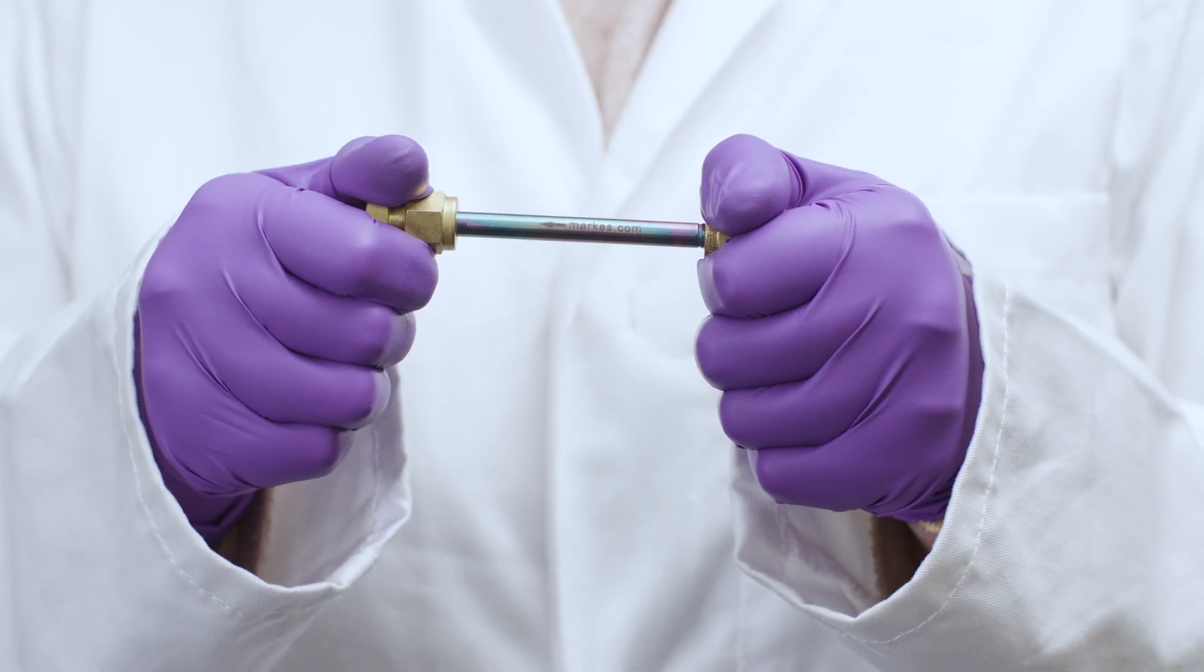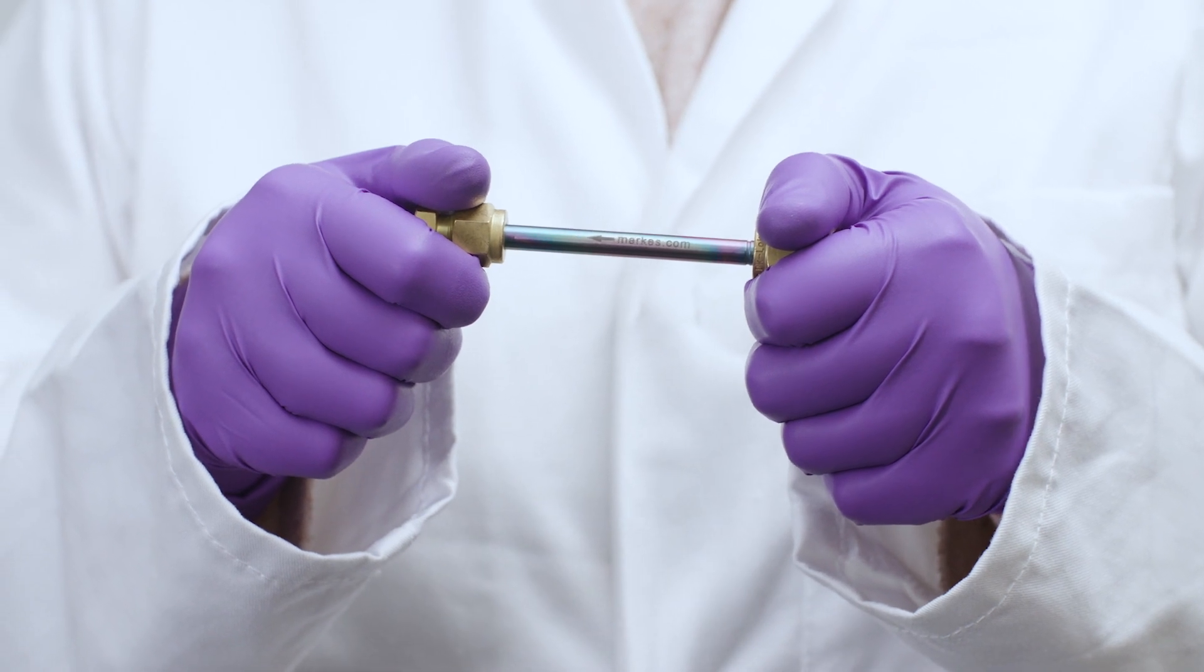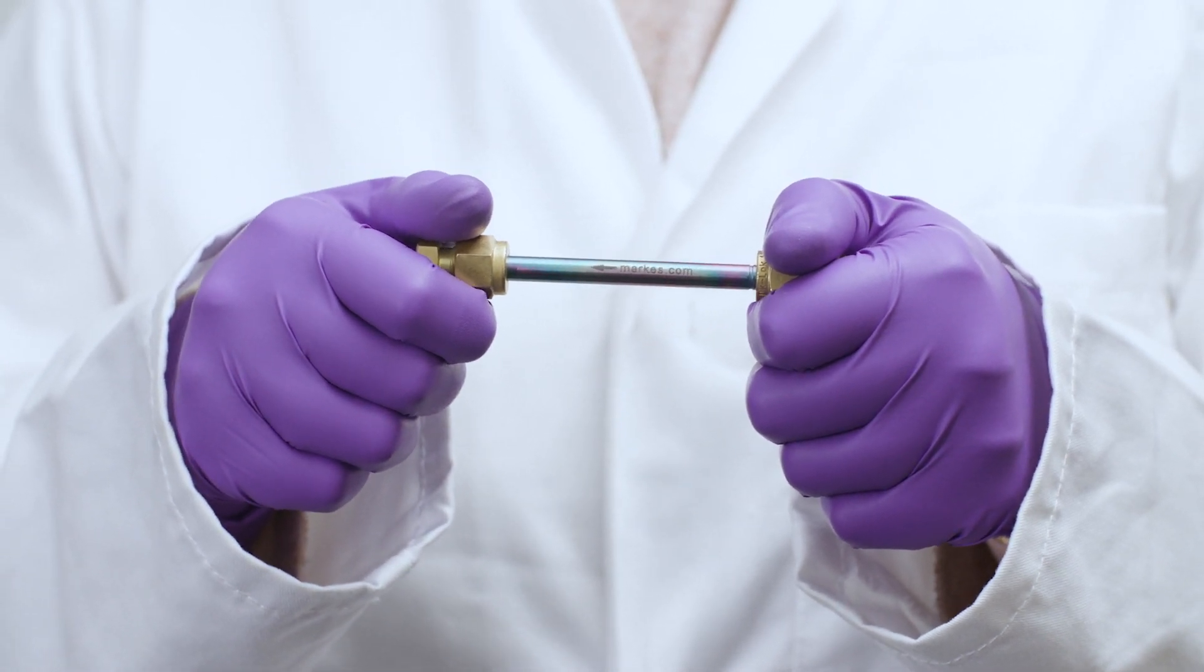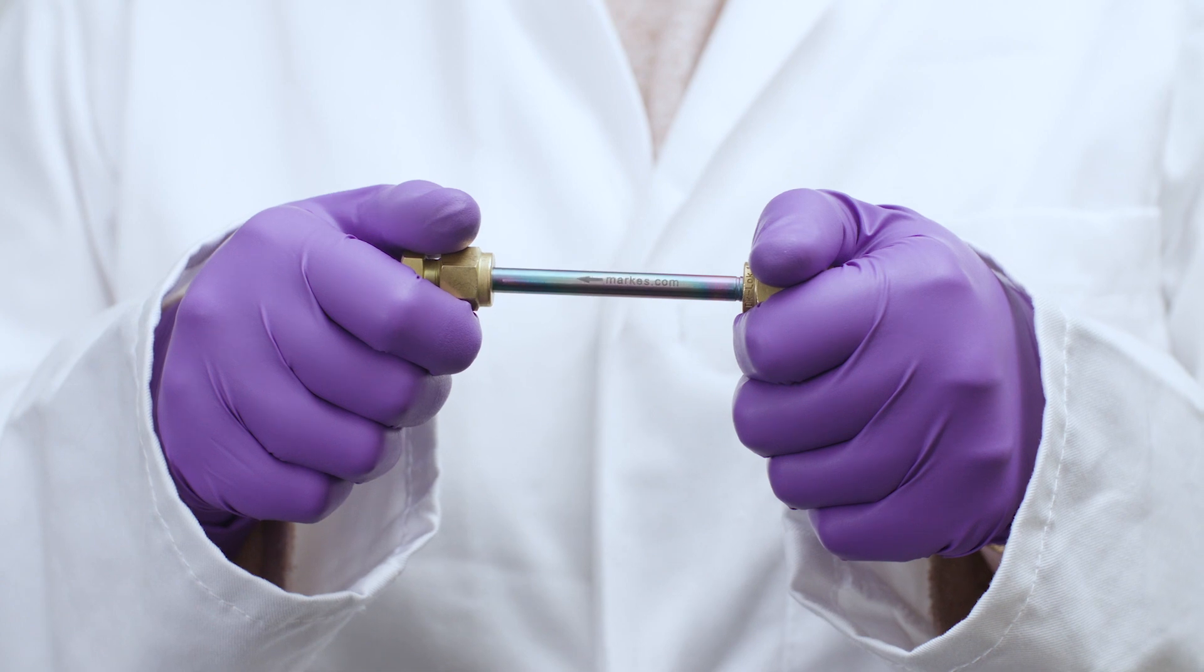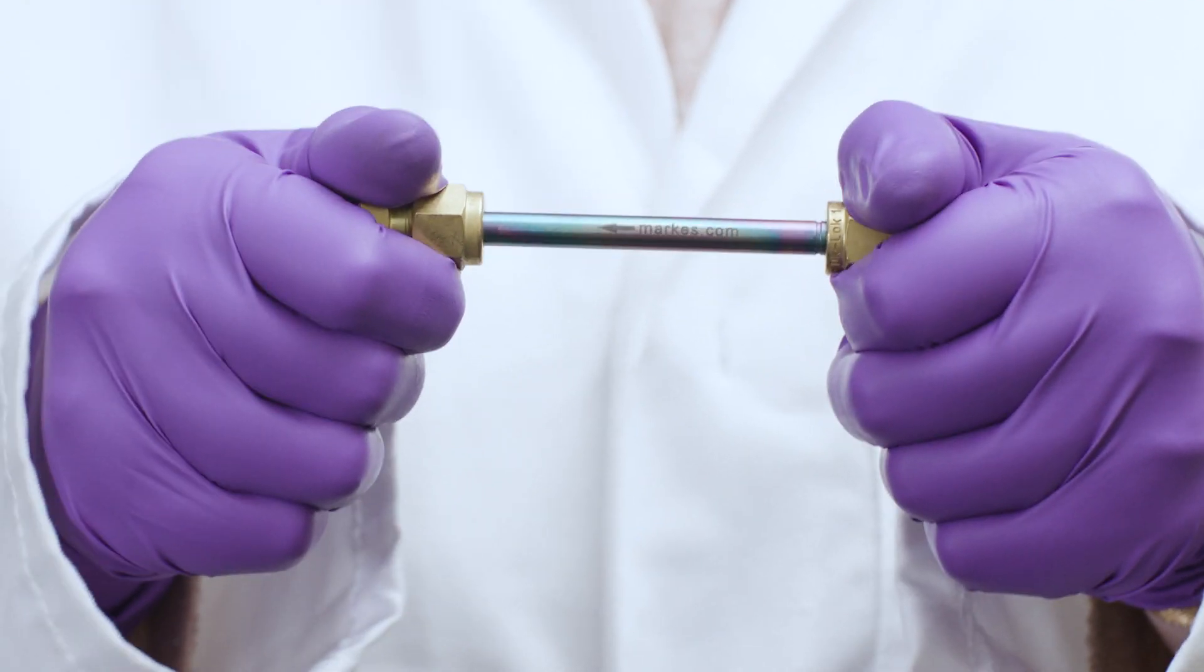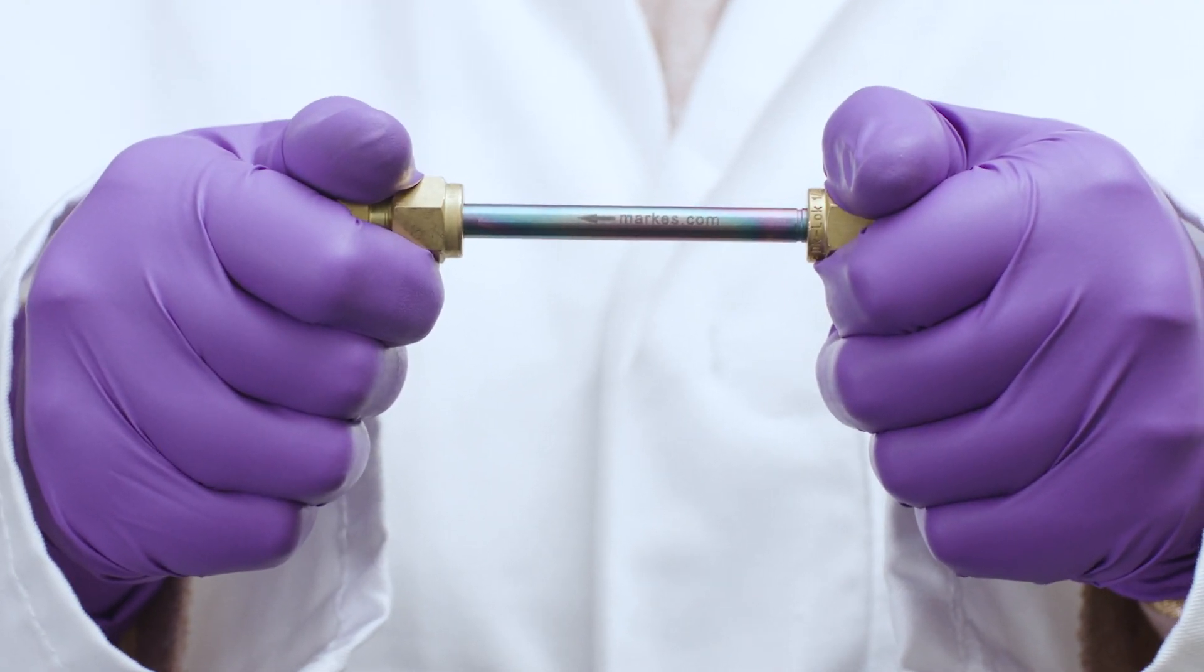To ensure cap tightness, grip the storage caps firmly and attempt to pull from the tube. Any caps that can be removed easily this way are not tight enough and should be re-tightened with the cap lock tool.